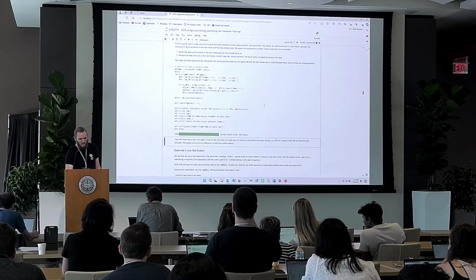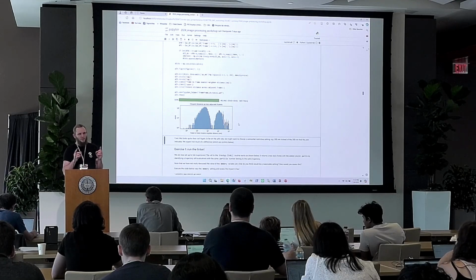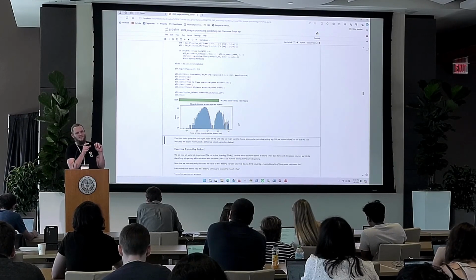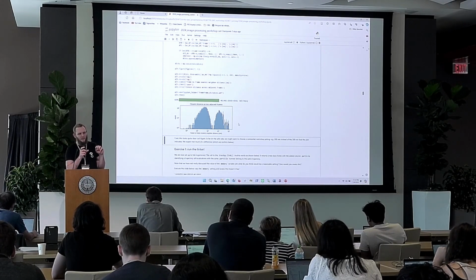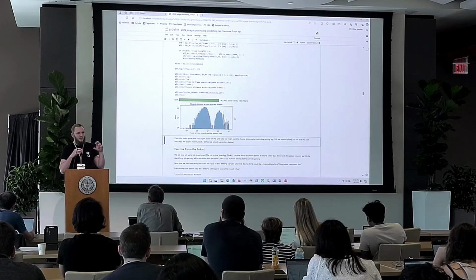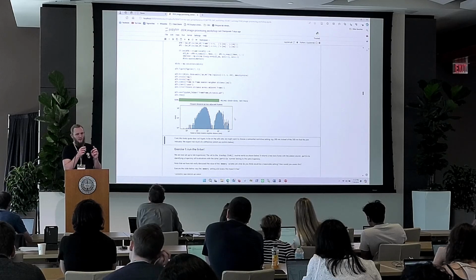If we execute the code cell, we get the distribution, for each particle in each frame, of the closest distance to any localization in the next frame. And what you can see here is that this is clearly very much bimodal. If the same particle exists in the next frame, there will be two localizations across these two frames that are very close together.